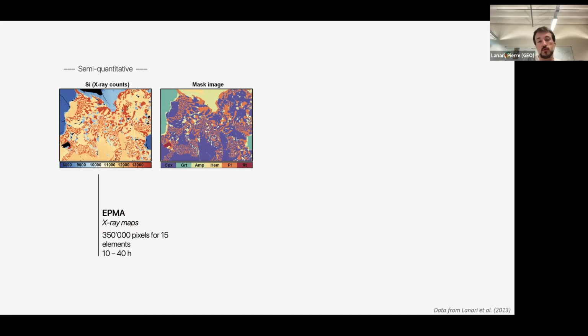And you see the result is quite impressive. You already have a good resolution. This is a high pressure rock from the Himalaya. What you see is this fine grain intergrowth called symplectite. I'm sure you know about that. And it shows the decompression of the sample.